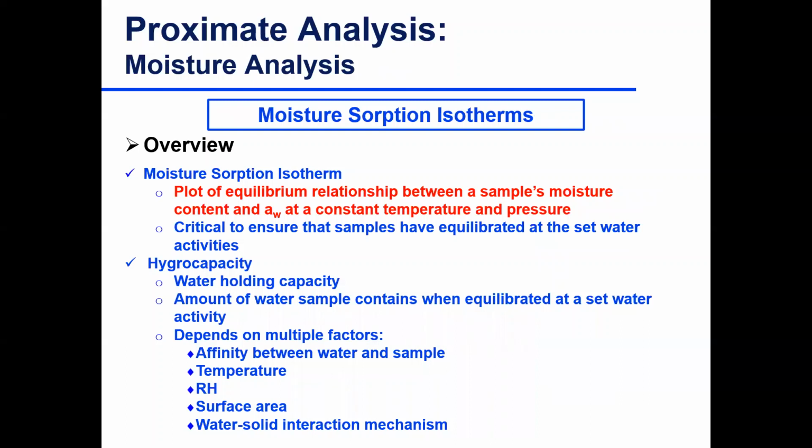And this is the idea of plotting a relationship, determining the relationship between composition of a product and moisture content. So again, you can better understand water activity and what to expect. There are all kinds of factors that go into determining the relative humidity of that product, or the water activity of that product.